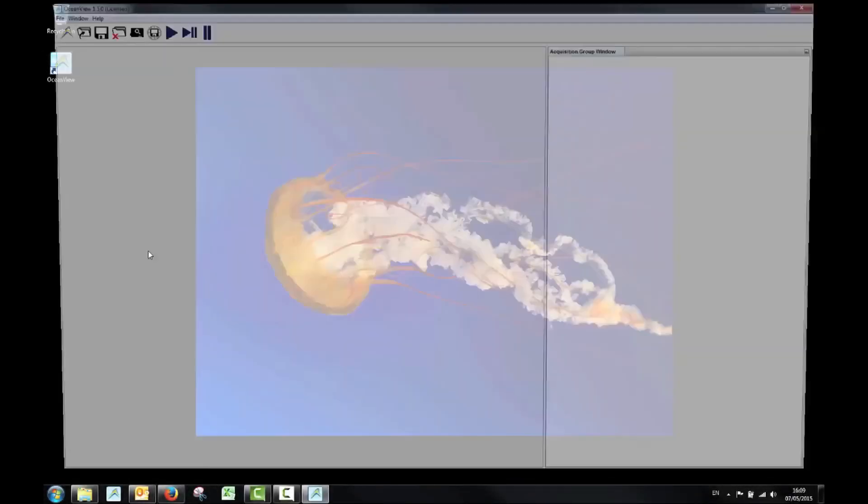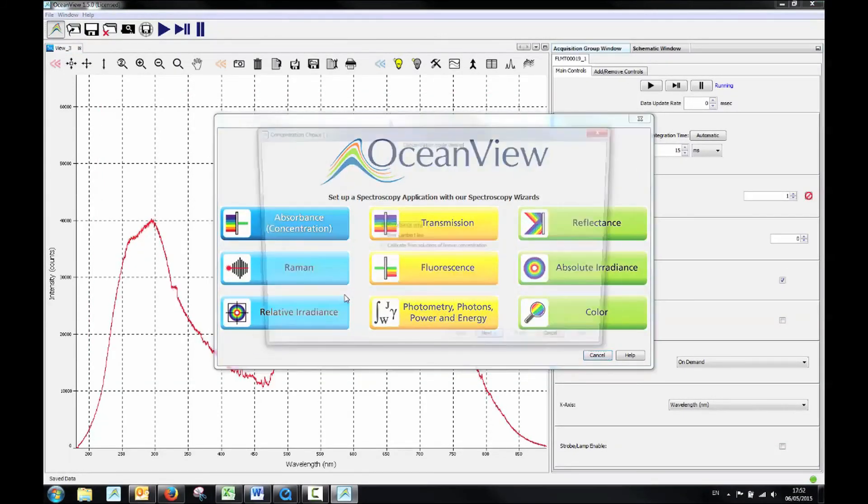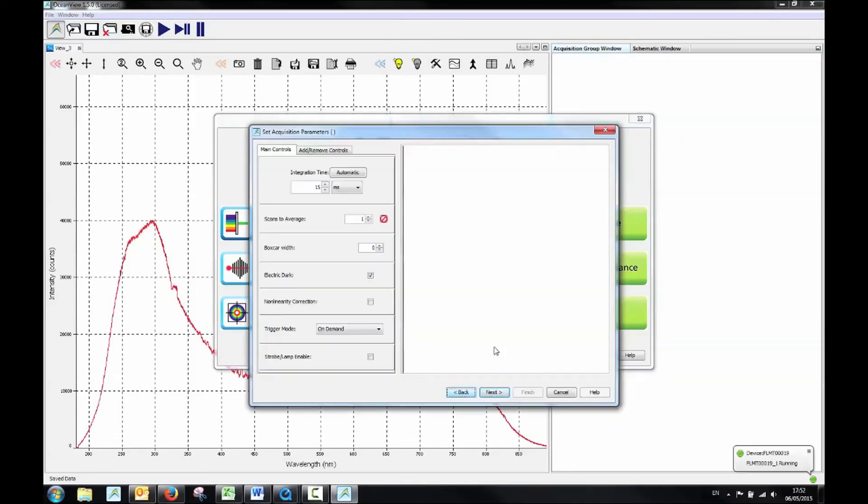Once you've done this you are ready to connect your spectrometer to OceanView software to begin collecting data. Look for additional videos demonstrating how to perform an absorbance measurement using OceanView software.